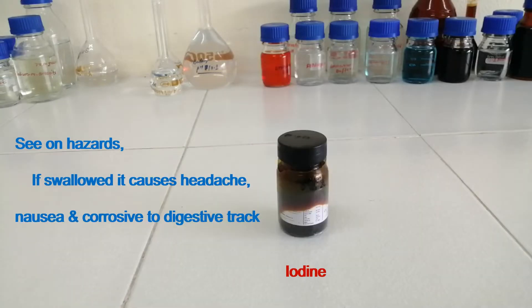This is iodine. See the hazard of this: if swallowed, it causes headache, nausea, and is corrosive to the digestive tract.